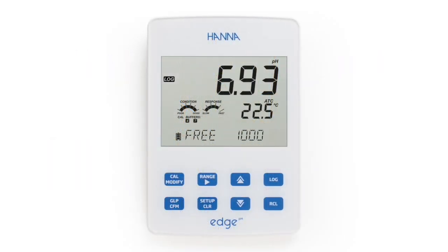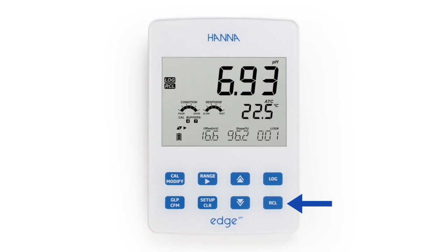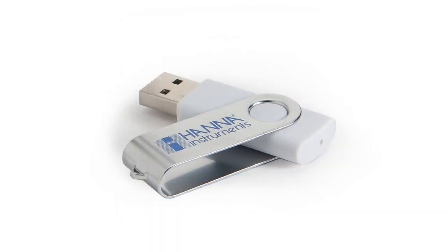Up to 1,000 measurement readings can be stored by using both log-on-demand and interval logging. A reading can be logged by simply pressing the log key, and stored data is easily recalled by pressing the recall button. These log measurements can then be transferred directly to a PC or stored on a USB flash drive.